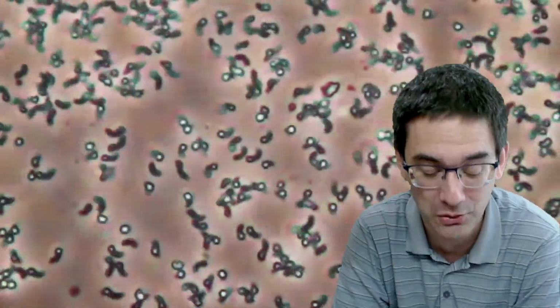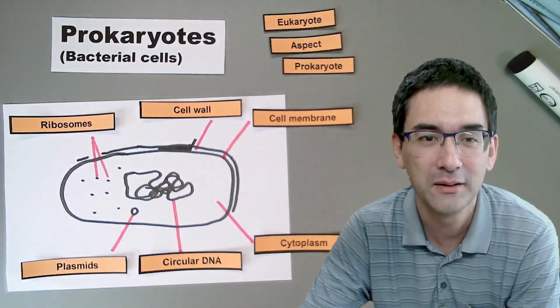But I have to tell you, because of their relatively small size and because inside the cell you do not see any cell organelles, bacteria are kind of difficult to observe under the microscope. But I just wanted to show them to you, that they look quite different to plant and animal cells, of course. But they do all of the functions of life nevertheless. So let's move back here. Here we go again. Okay.